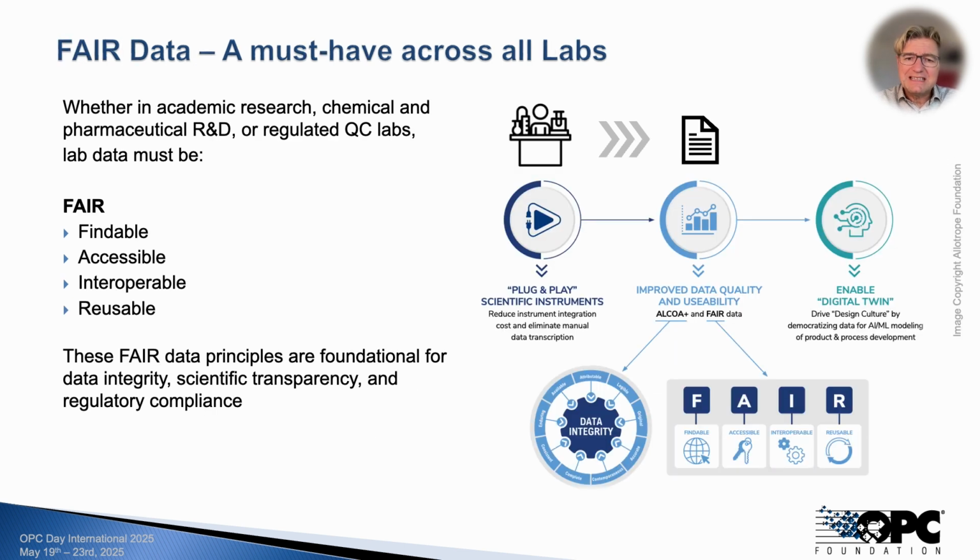FAIR data isn't just a buzzword. It's becoming a core requirement across all lab domains. In academia, FAIR principles support transparent and reproducible research. In chemical and pharmaceutical R&D and quality control, they ensure reproducibility and enable data reuse across teams, sites, and systems. And in regulated environments like GMP and GLP labs, FAIR data is key to ensuring compliance, auditability, and long-term traceability.